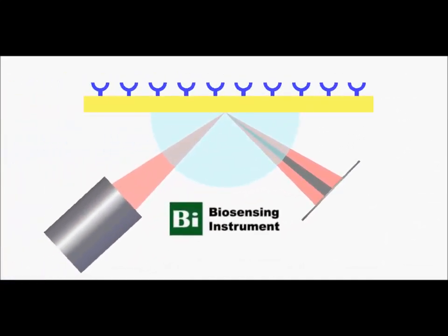The information that can be obtained from SPR serves as a simple, precise, and label-free technique for quantitative analysis of molecular binding interactions.